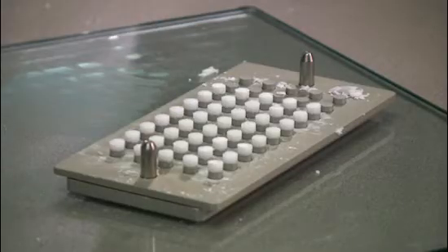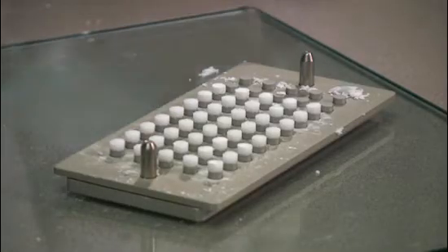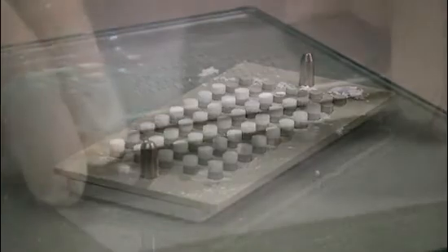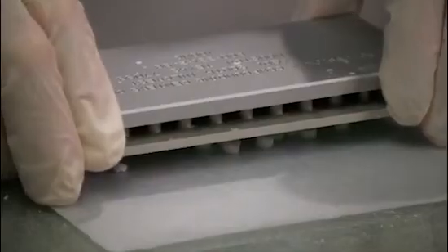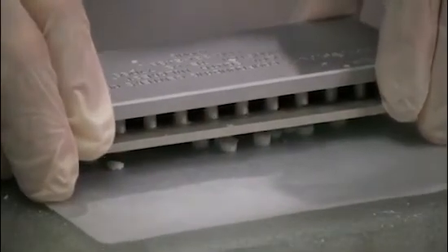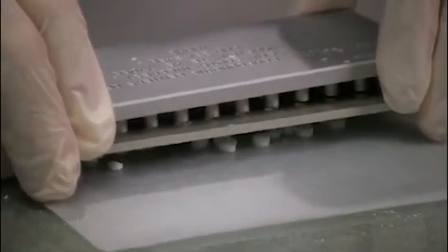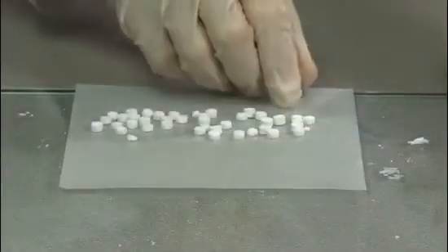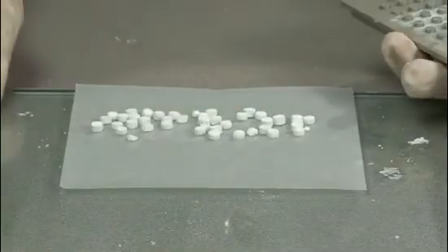Leave the tablets on the pegs to allow them to dry. In most cases, they will dry in 1 to 2 hours. After the tablets have had a chance to harden, invert the plate, push down on the cavity plate until the tablets come loose, and your tablets are ready.